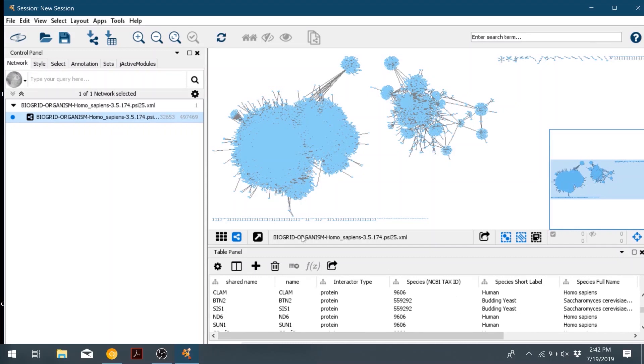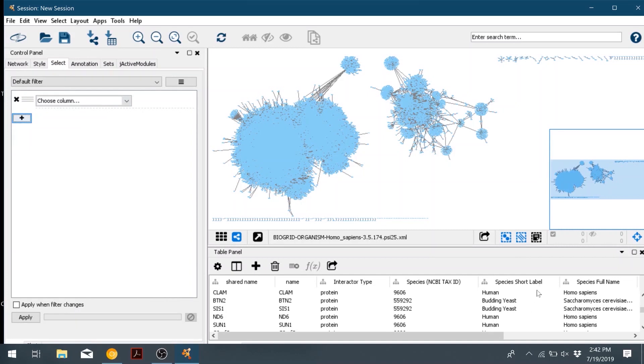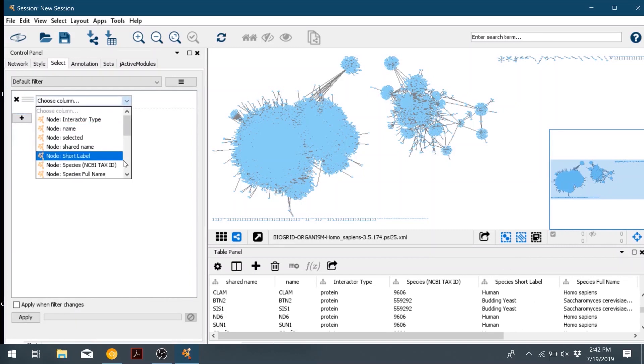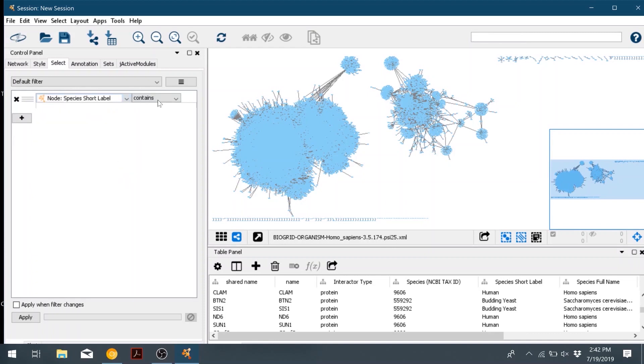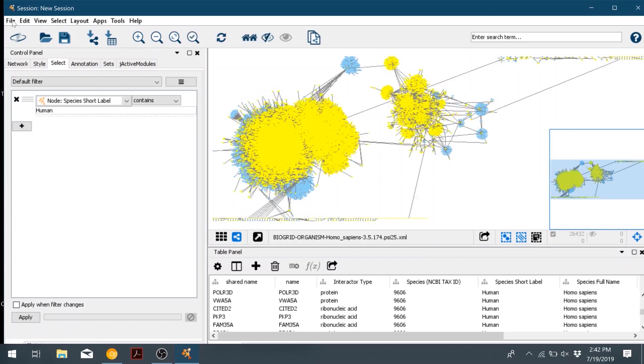We're going to go to select and then click the plus sign. We're going to choose for the column, we're going to choose species short label. We're going to choose contains, and we'll type human because that will include both human and human papillomavirus. Then click apply. This will select all the nodes that correspond to the filter we want, and then they light up in yellow.